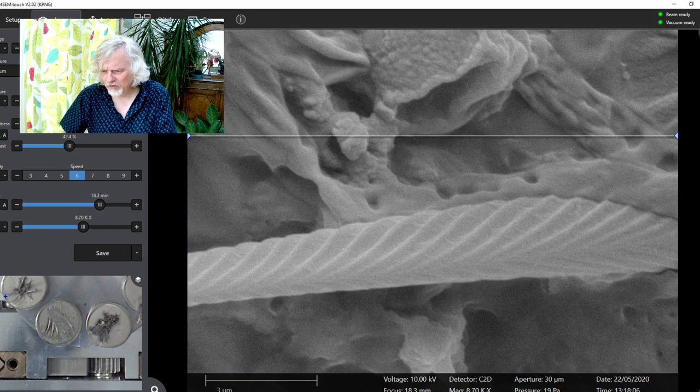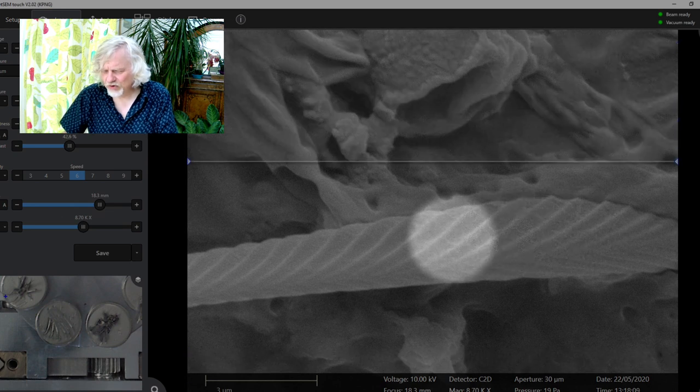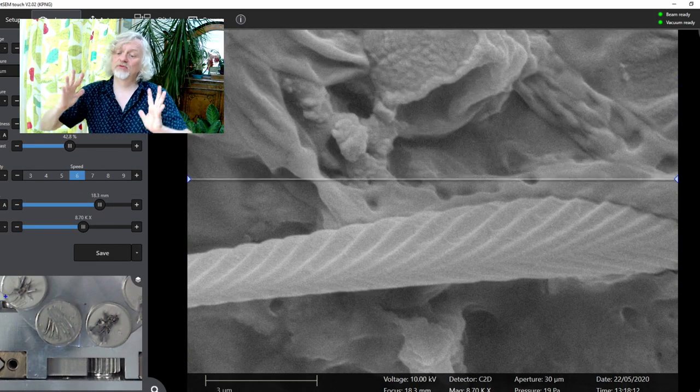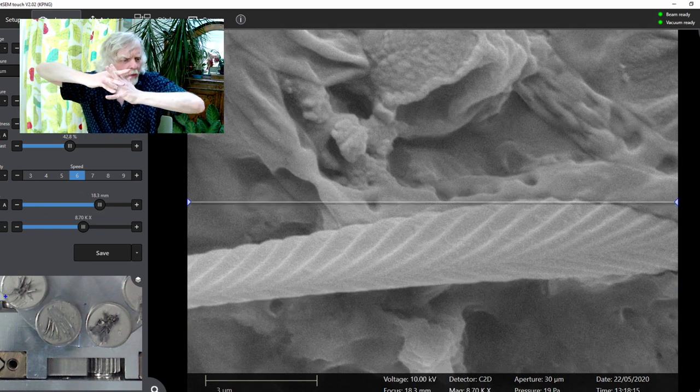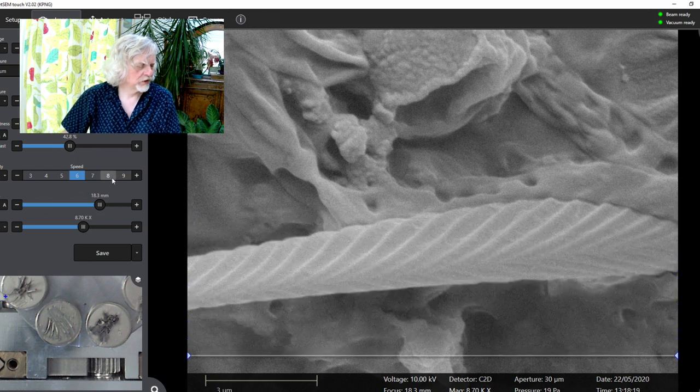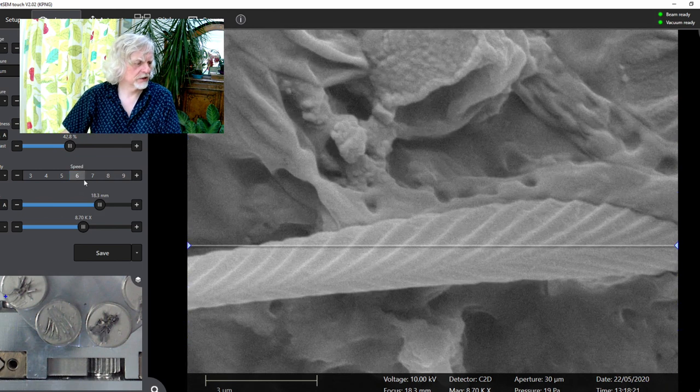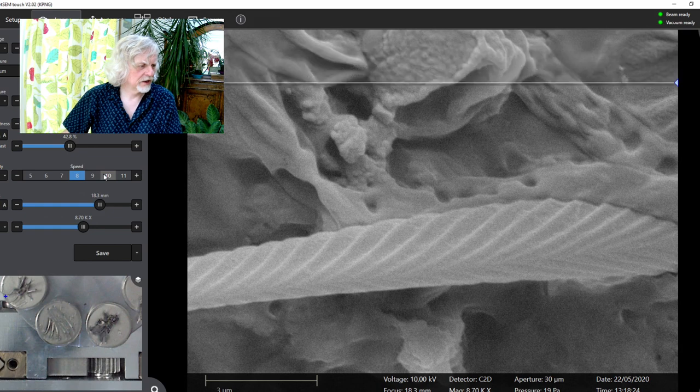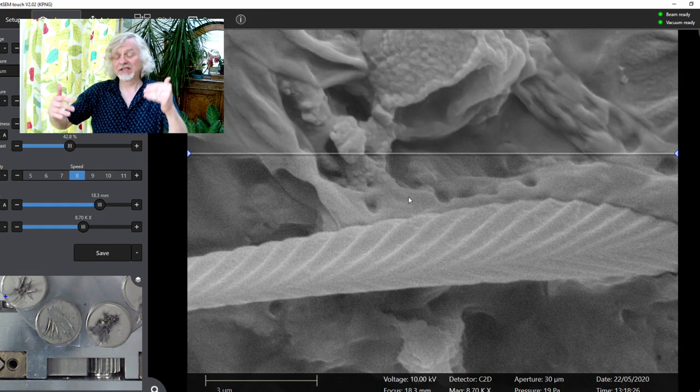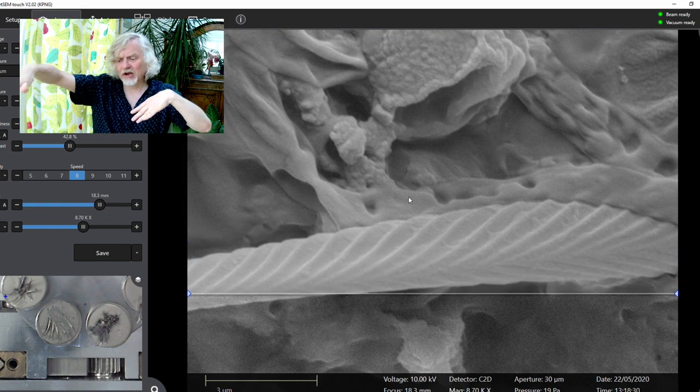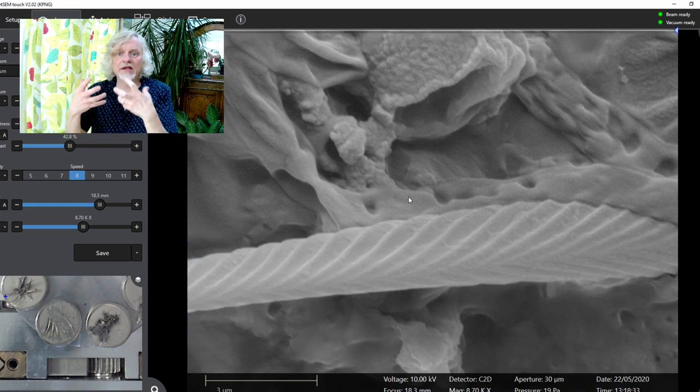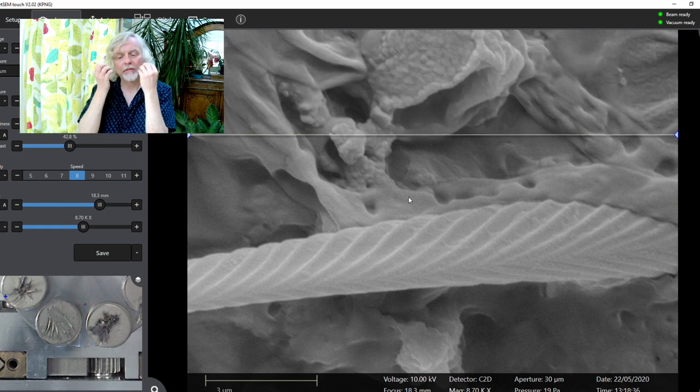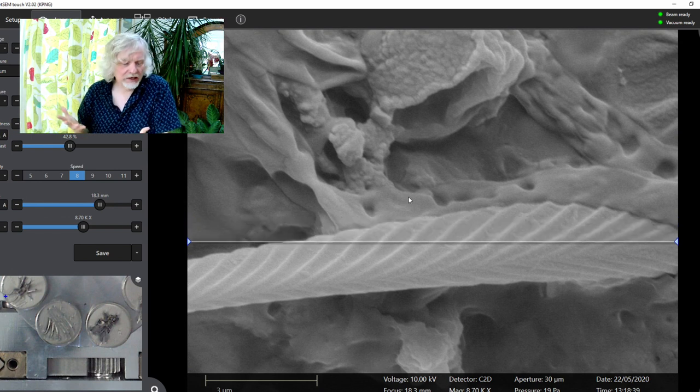If I move my mouse over here, you've got these ridges on the hair. It's not spirals. It's sort of ridges that are going up together and meeting at the top like that. If I turn the speed down a little bit, we'll get a better image. You get a better image because this is a scanning electron microscope. The electron beam is scanning across our sample and that's giving us the imagery and the slower the beam scans, the more detail you get, but the slower it takes.